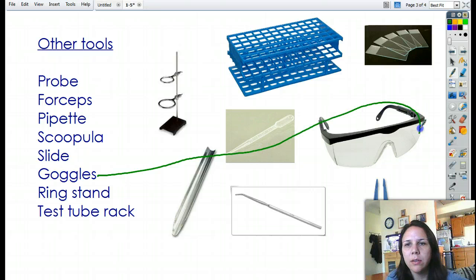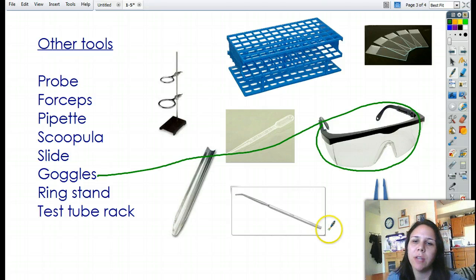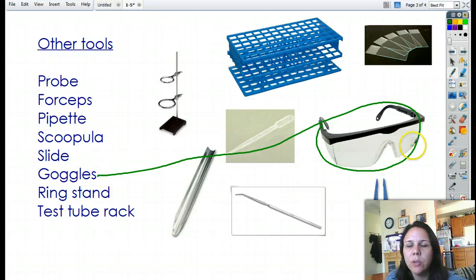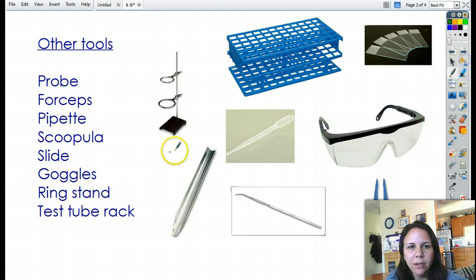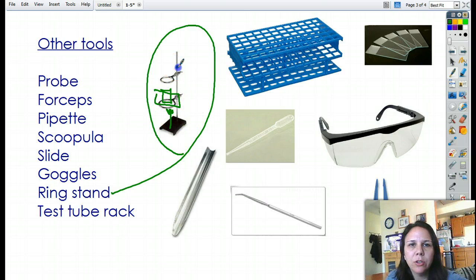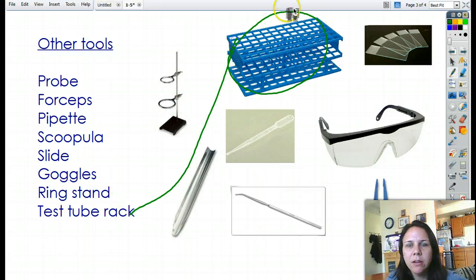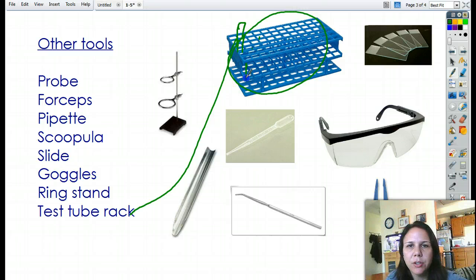Then we have goggles to protect our eyeballs from any chemicals that could ruin your vision for the rest of your life. Even though they look dorky, you'd rather look a little dorky now than be blind for the rest of your life. We have a ring stand — sometimes we put a Bunsen burner underneath and cook stuff on top like a beaker, and sometimes there's a little clamp that we can put test tubes in to hold on to. It's very versatile. And the test tube rack — you put your test tubes through the little holes and it holds them so they don't slide out and break.